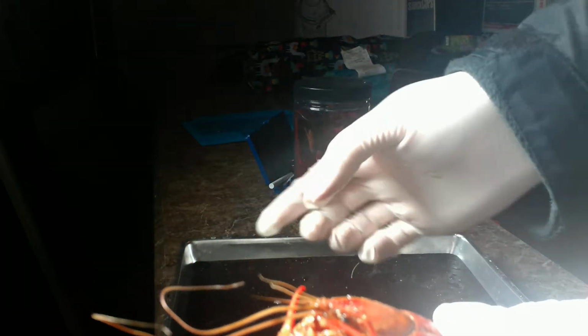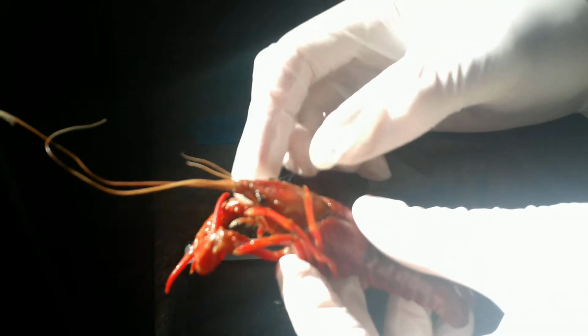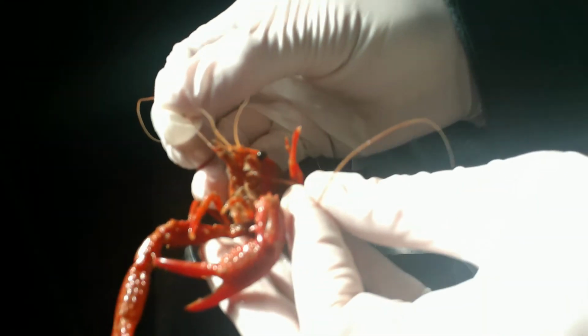So starting from head to toe anatomy, we have antenna that are used for sensory coming off the top here. We have our eyes that can actually work independently of each other. Right after that, then we have our rostrum, which is kind of like a nose. If you look in between the antenna, right in the middle there, that's our rostrum, which works like our nose.